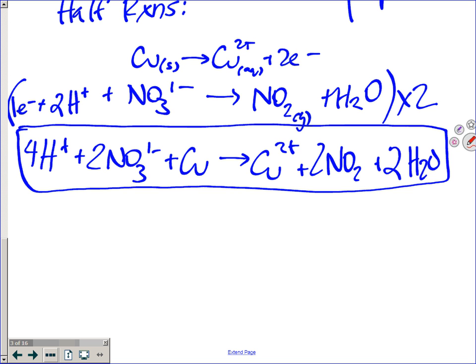Everybody look at the data provided for you below that in the paragraph. It says I'm giving you a piece of brass. I'm approximating it's 1.5 grams, but we don't know that exactly right now, so let's just set up this calculation. Assuming that the entire brass sample was copper, is that a true statement? No, right, but if we assume the entire 1.5 grams of brass is actually copper, and we add this nitric acid on top of it, who's the limiting reagent? The copper in the brass, right? Who should be in excess? Nitric acid, which means that all of the copper should come out of our brass sample, assuming that we have a good sample of it.